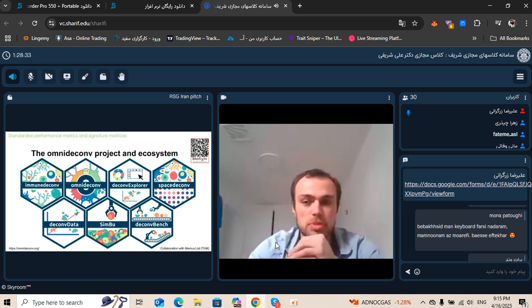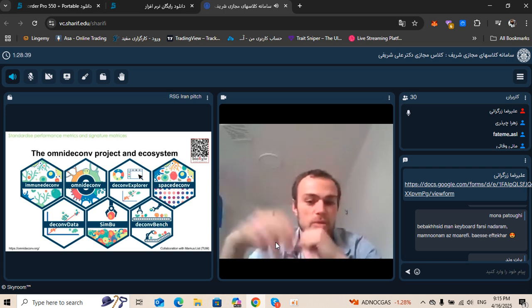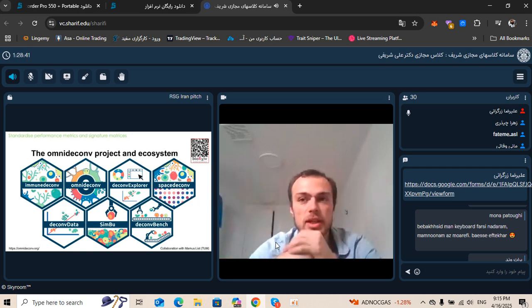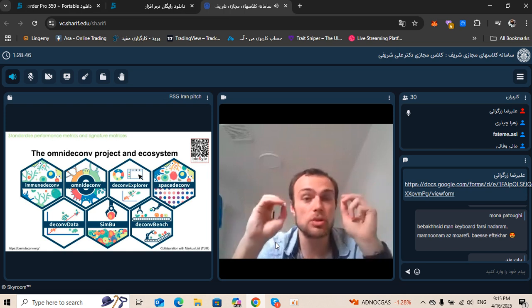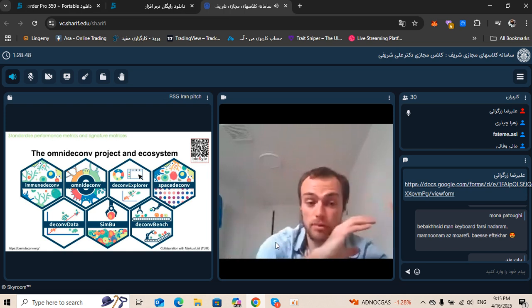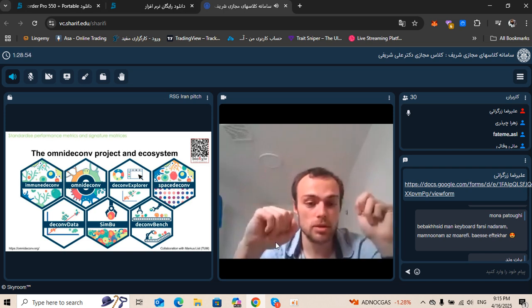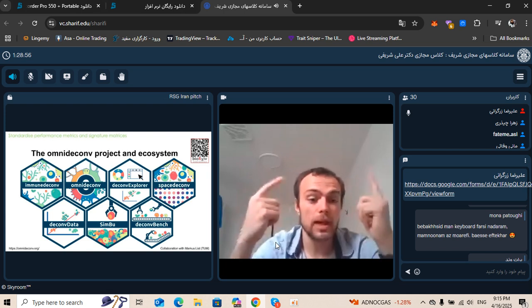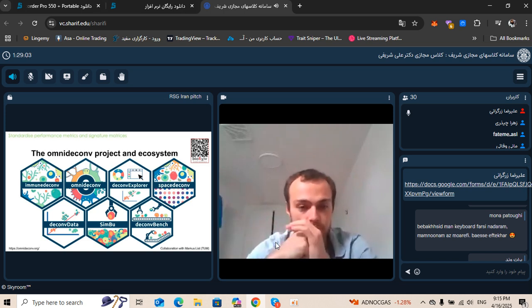So here it's for a species, but the same applies for a given tissue or a given tumoral subtype. The most important thing is that your cell-specific expression profiles are the closest to the true biological reality. So do not include irrelevant cell profiles, but do include all the cell types that you may consider present and significantly present in the bulk profile that you want to deconvolve.